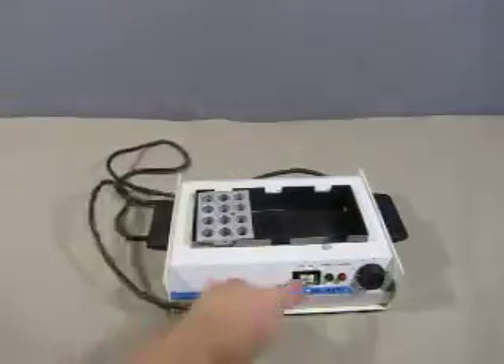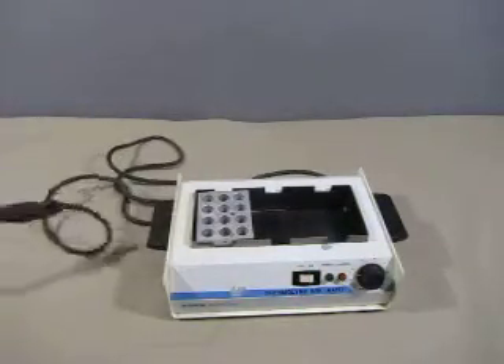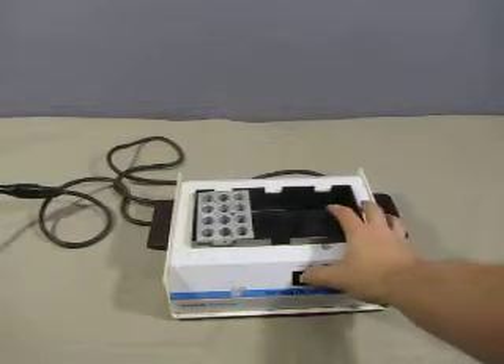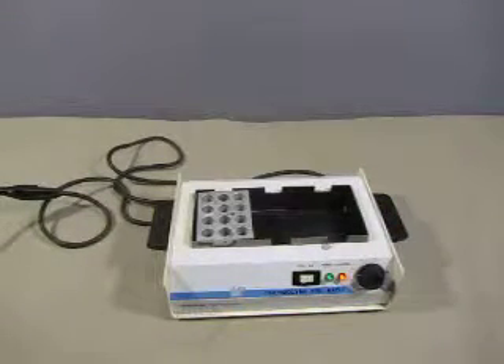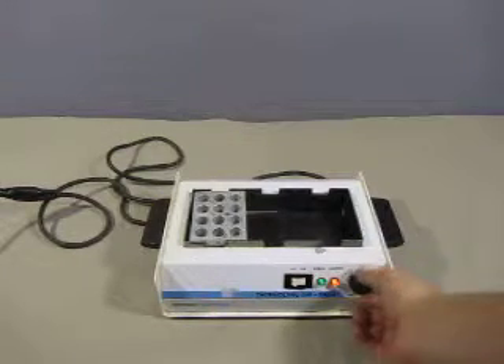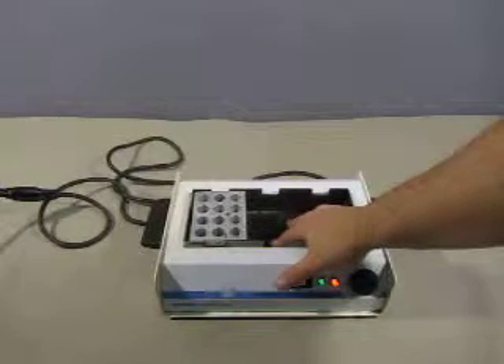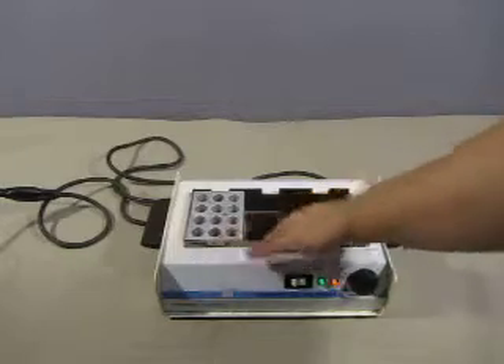So let's turn it on and see if this sucker works. And... oh! It works! We've got power, control, and the temperature knob goes all the way up. We'll give it a couple seconds to see if it warms up.